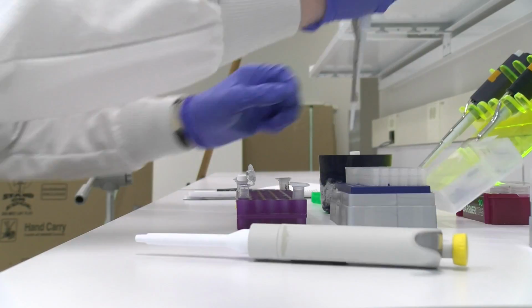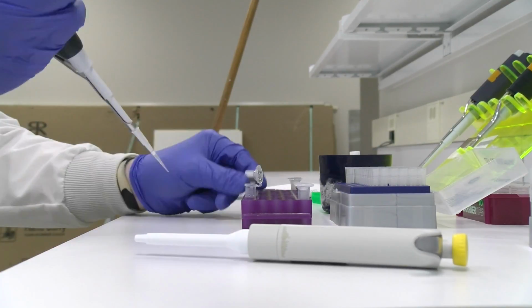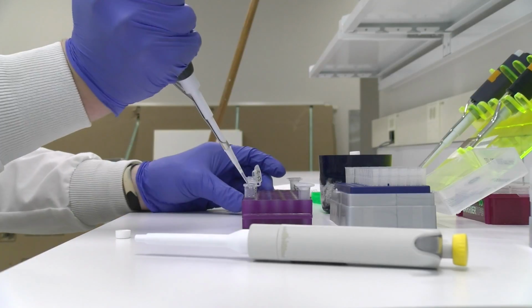In a 1.7 microcentrifuge tube, add your water, nucleotides, and reaction buffer. The reason that you're combining these 3 materials together right now is because they'll be the same regardless of what DNA you use in the experiment. However, if you're trying to amplify multiple samples, make sure that you're using the respective primer to each sample of DNA, or else the region that you will amplify won't be the correct one.